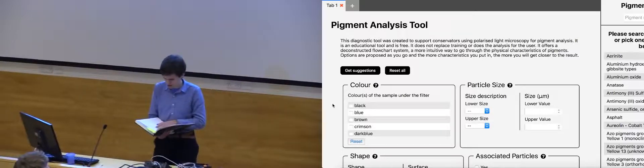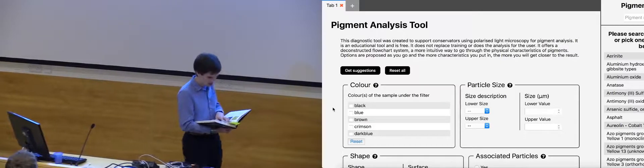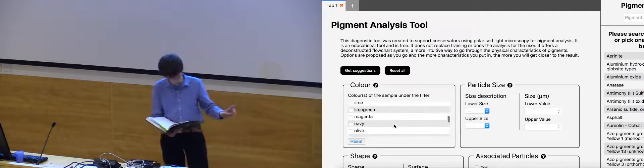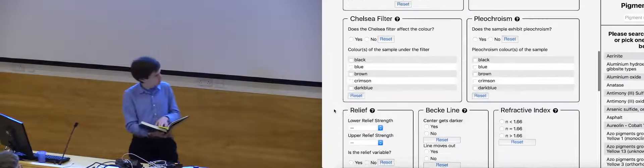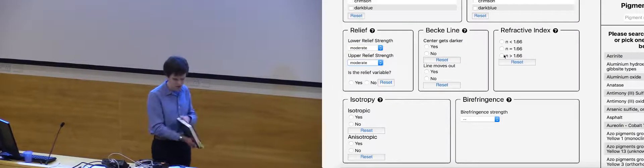Entering up the characteristics into our programme. In plain polarised light, cobalt tin oxide, cerulean blue, forms translucent turquoise blue grains with moderate relief and a refractive index greater than that of the medium.